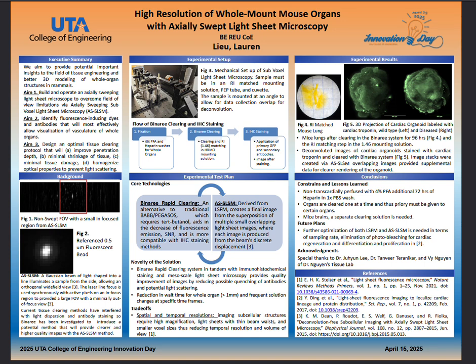Figure 1 illustrates a system with a small field of view in focus.